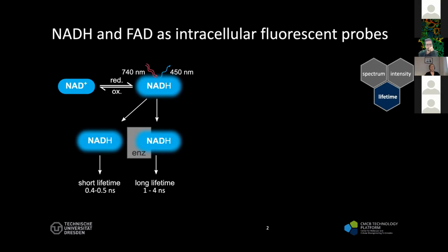There have been, in the past years, nice publications, for example by the lab of Melissa Skala, showing in vitro experiments how the interacting protein affects the NADH lifetime. I think this is a field which requires a lot more attention, and there's still a lot more to learn and find out about metabolism.